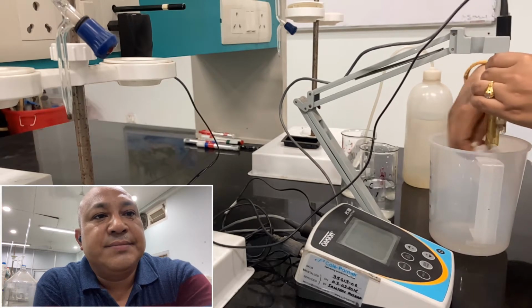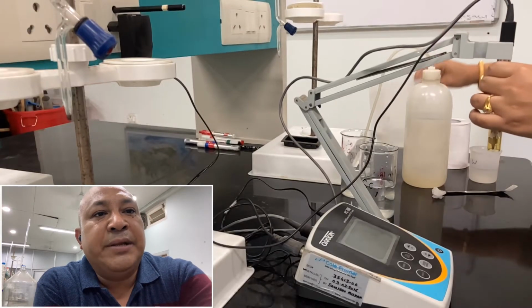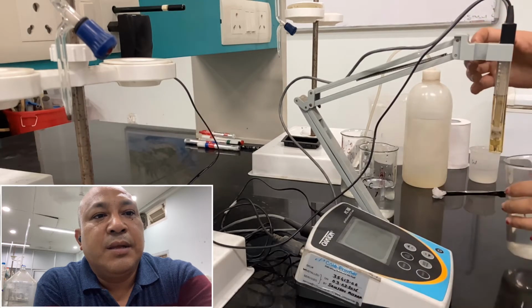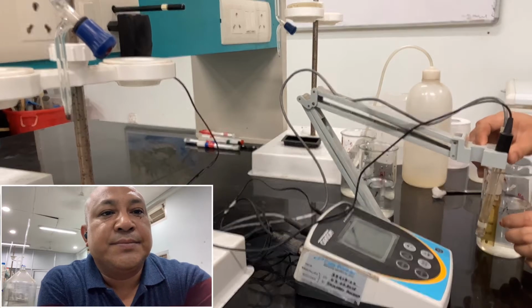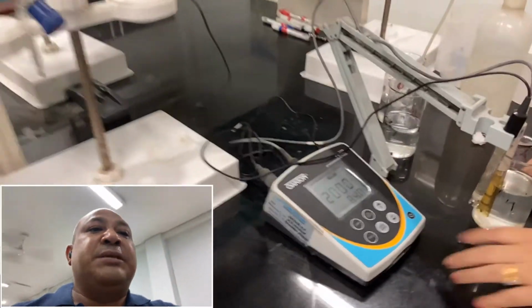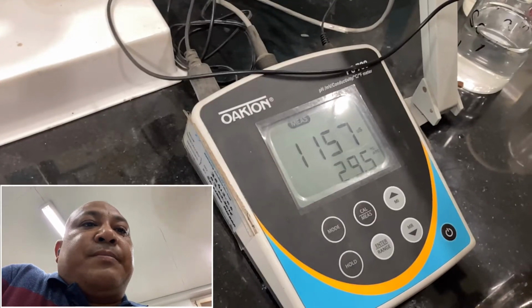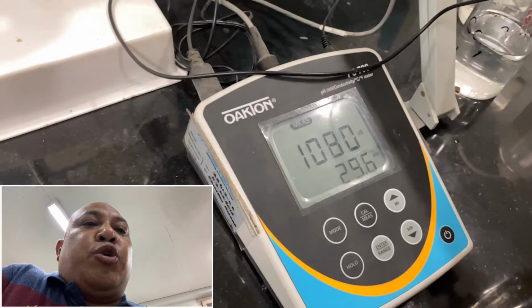And then we are going to dip in a new sample, and we check the measurement. Now it is coming around 1100 or 1000.